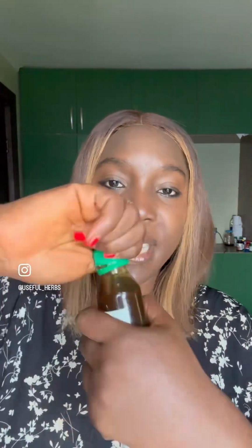So I have clean test tubes, and I'm going to take a few drops of each product and put it in the test tubes. This is the Enantia chlorantha protoberberine alkaloid toner, one of our products. I don't need a pipette. I can use the dropper of the product to bring out some yohim tincture.